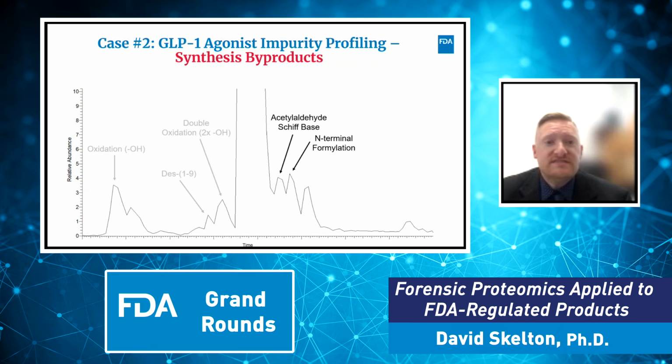We observed synthesis byproducts. So we have an acetaldehyde Schiff base. We also observed formylation of the N-terminal amino acid on the GLP-1. These result from reagents used during the synthesis process that produce these byproducts and them not being properly removed during the subsequent purification steps.